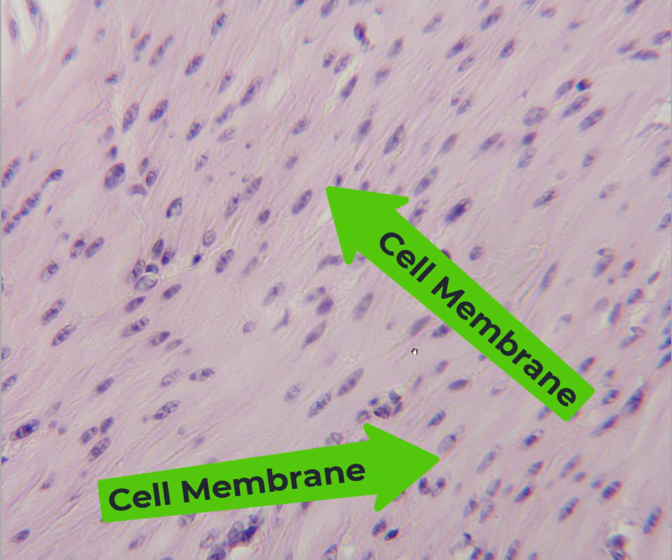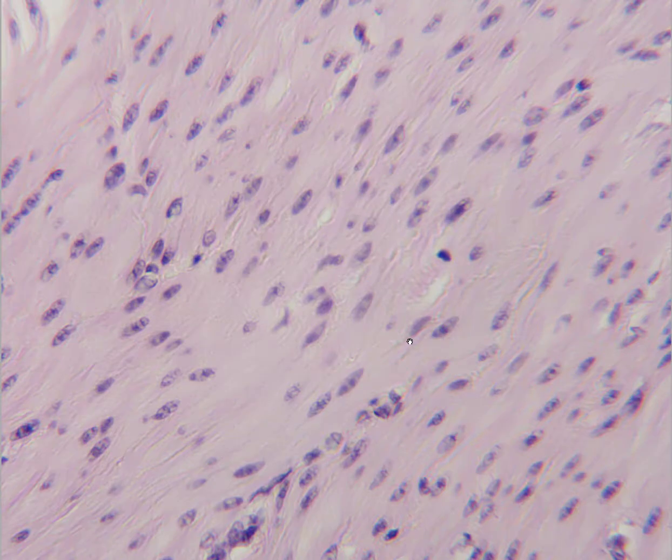So this is our smooth muscle, and we find this surrounding hollow organs. The epithelium lines the hollow organs, but outside the epithelium and the connective tissue to which it is anchored, we have these layers of smooth muscle. And in most digestive organs, it's 2 layers. In the stomach, it's going to be 3 layers. And we're going to see that they're arranged longitudinally and circumferentially around the organ. And once again, you can see very nicely these big purple cell nuclei here. You can see the cytoplasm that surrounds it, and then you can make out the cell membrane again. And these are long tapered cells.